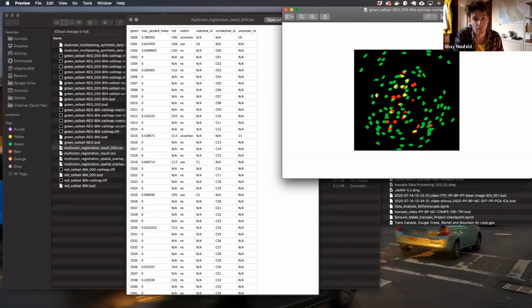Totally. Then I would have a different question. Let's assume that you did the PCA-ICA on one of the channels. Can you then use these contours and apply them to the other channel? Or assuming you draw the ROIs manually in the static image, and then you just want to extract only those traces, without running any analysis, can you directly use those contours? Yes, you can. You can do apply contours to put the contours of one cell set onto another movie. Okay.